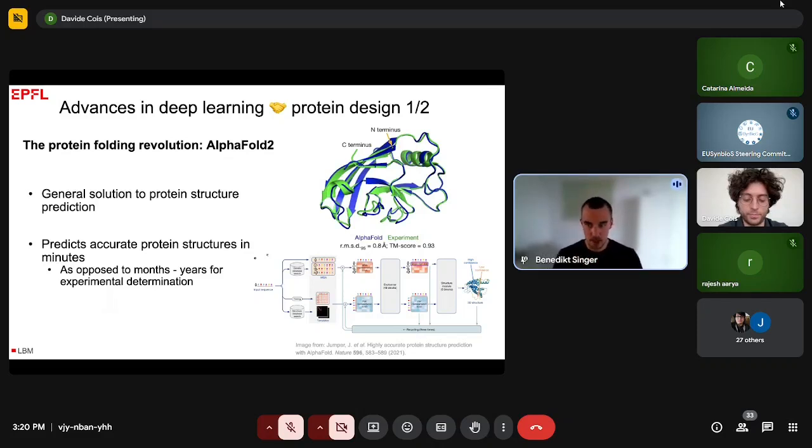I'm pretty sure all of you have an idea what AlphaFold is, but I'm just very briefly mentioning some caveats or some things I like a lot about it. Most of them are details, but they make it very interesting. So we know it's a structure prediction network. It's trained on the whole PDB. It will give you the structure of a sequence with some evolutionary information.